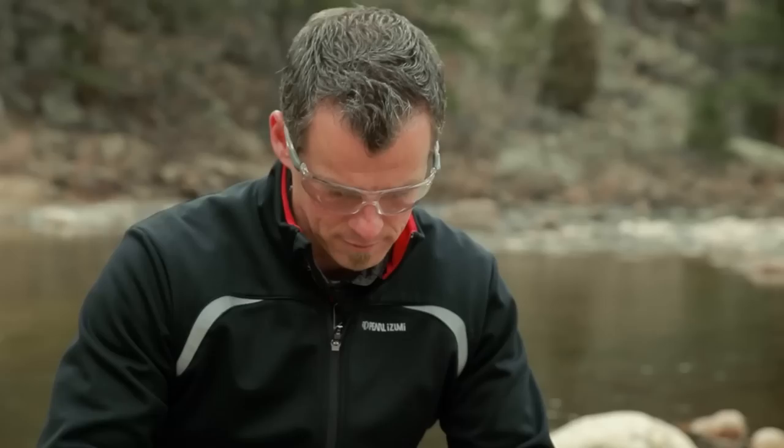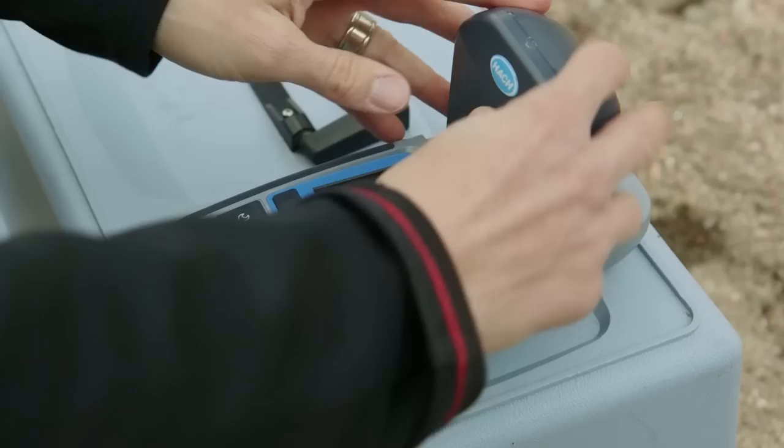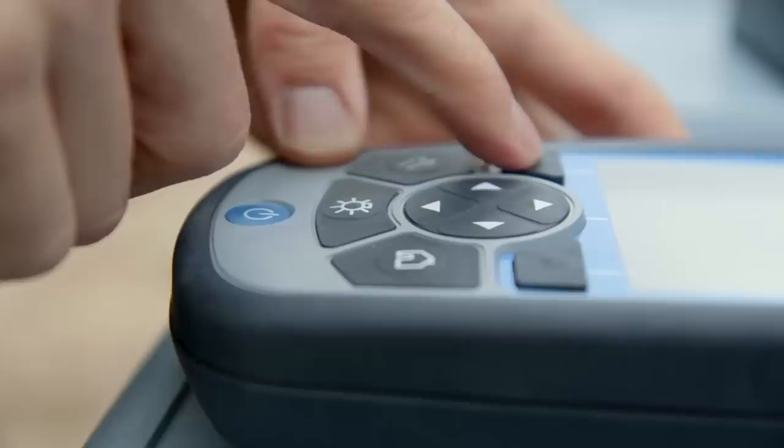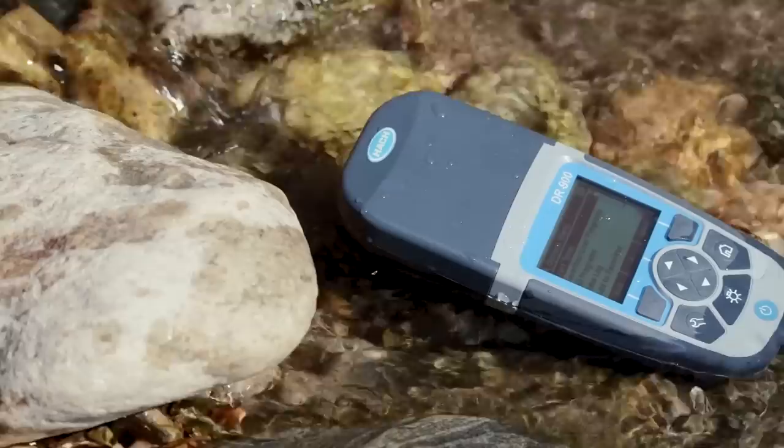We know you want to simplify your testing, so you need equipment that tests as many parameters as possible, and you can't be fumbling around with extra manuals. What does IDEAL look like in the field? Something that allows you to test your most common parameters quickly, protected against the elements, so you test easily and have confidence in the data without transcription errors.